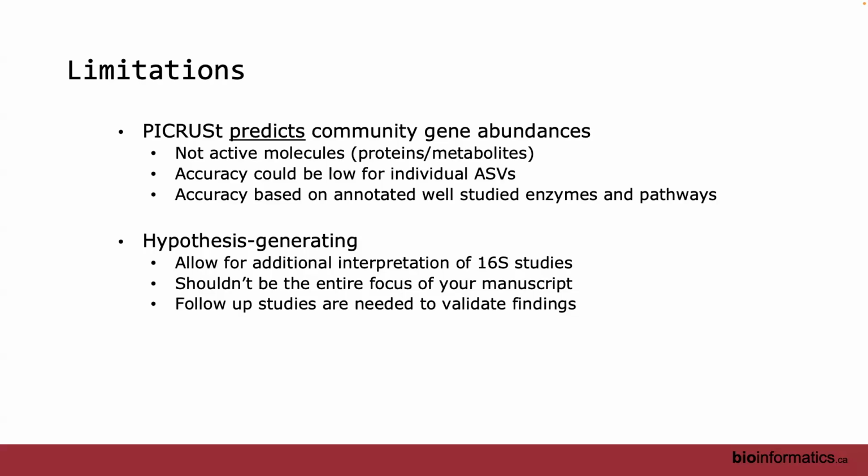And then, I didn't talk about this too much, but you can stratify for the functions that are predicted. You can look at the output and see what ASVs are contributing to that function. Oh, cool. So if there's a function that's really interesting, you can at least connect it back to the ASVs and do that sort of interpretation too.